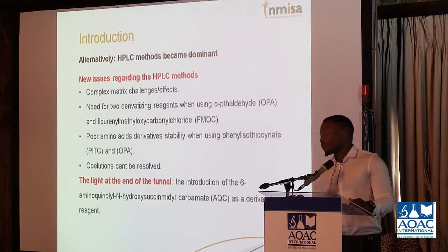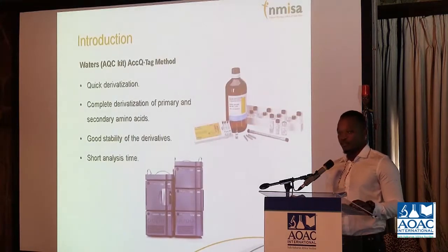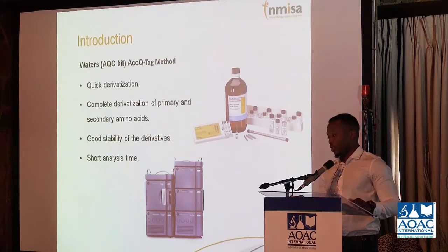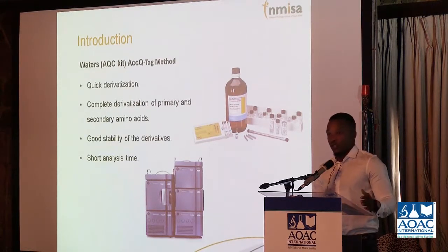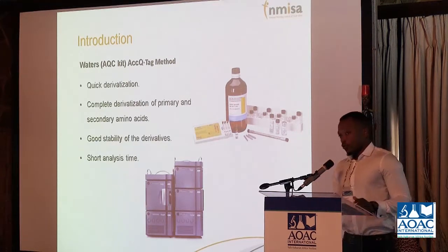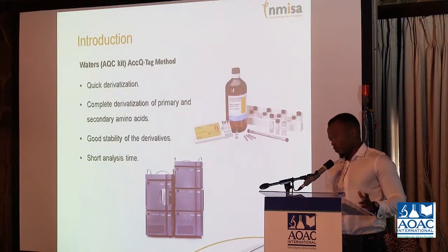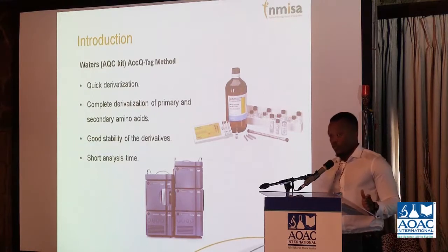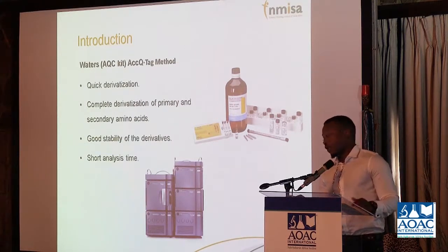But the light came at the end of the tunnel with the introduction of the AQC method. This method has been mastered by Waters with the introduction of the AQC kit, which is known as AccQ-Tag, or that's how we call it in the lab. With this one, you can do a quick derivatization using only one reagent. This takes about 10 minutes, gives good stability of the derivatives, and also gives you a short analysis time of about 10 minutes.